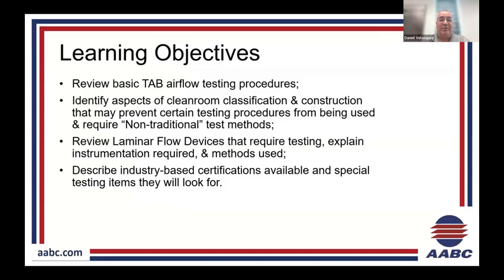Also, I want to review laminar flow devices, real brief, that do require testing, explain the instrumentation required and the methods used. And then we'll talk about some industry-based certifications along the way and special testing items that they will look for. If you do have questions, feel free to ask along.